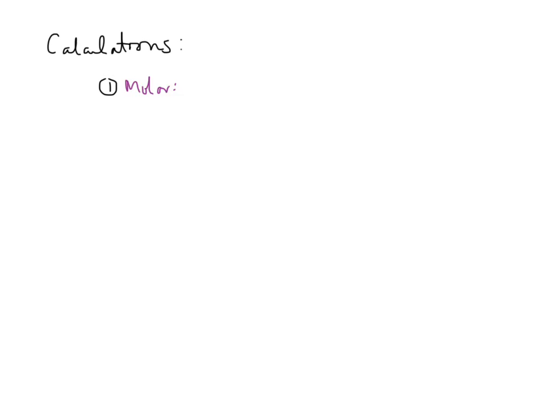So I think your instructions were like 9 mils of this. That's a lot. Okay, 9 mils of this and 1 mil of this for your known. And I think your instructions are to mix it up. It should turn red for you, for a total of 10 milliliters. And then later on you can calculate the molarity of everything given that 10 milliliter volume. So that's your known.